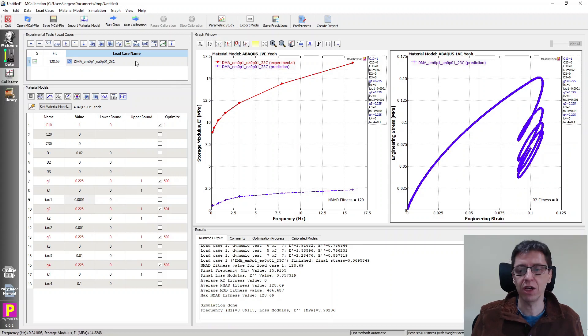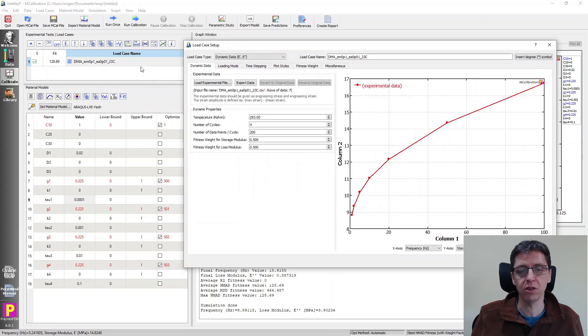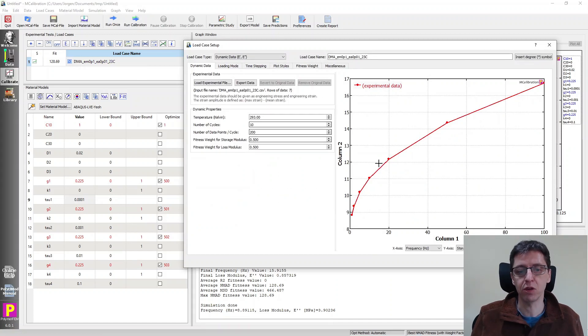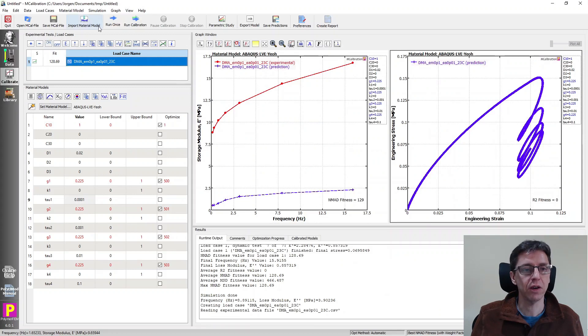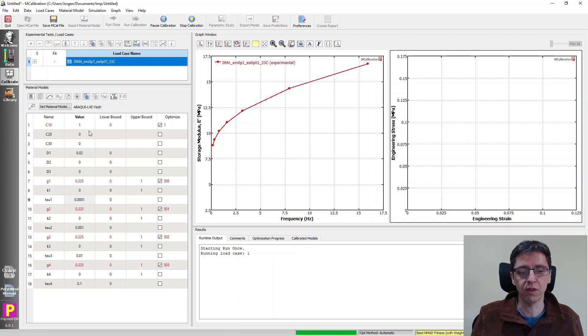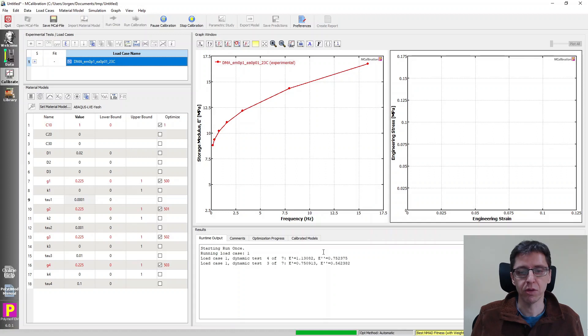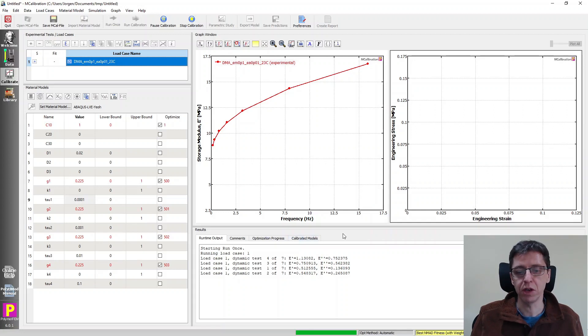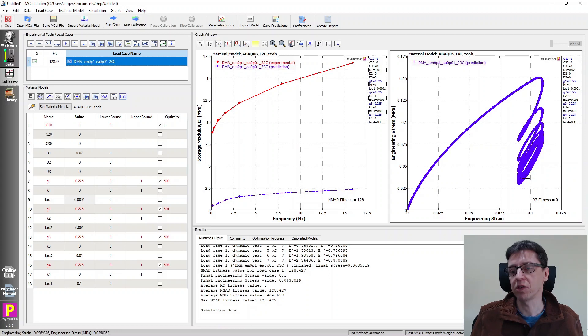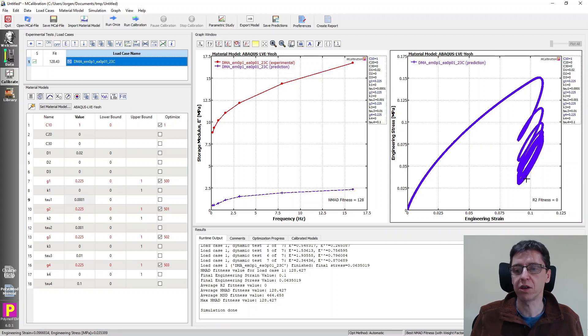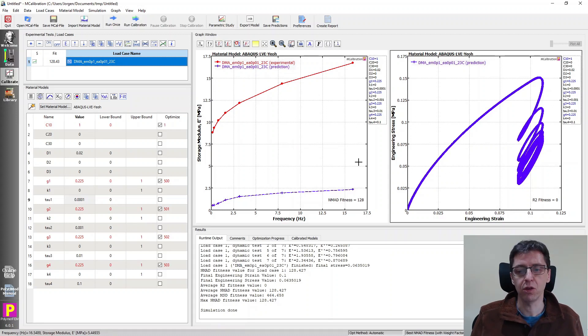So I'm going to change that. So I'm going to double click on the load case. I'm going to say instead of four cycles to equilibrium, I'm going to take it to be 10. And I'm going to run this again. And now it's taking and analyzing all of those seven rows. And it should plot for us the prediction of the storage and the loss modulus of the last row. Once it's done with this, this shouldn't change the predictions too much, but it should allow us to see if we reach more of a steady state. So we can see that now on the figure to the right, it's more or less a steady state response to the right here in the last cycle. So that's what you want to do. You want to make sure that we have enough cycles to reach the steady state in your material.